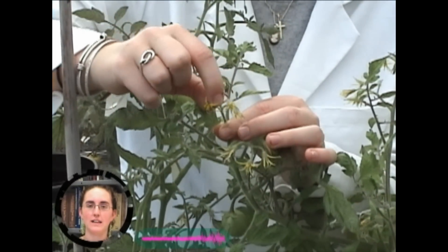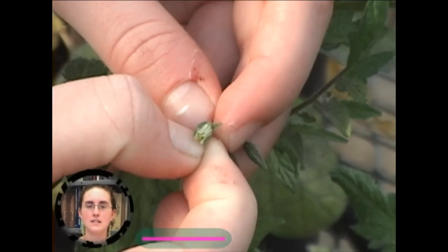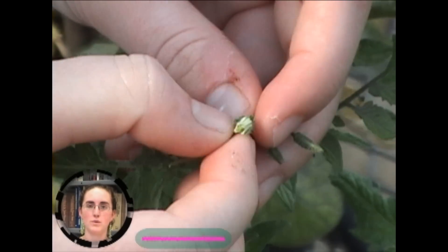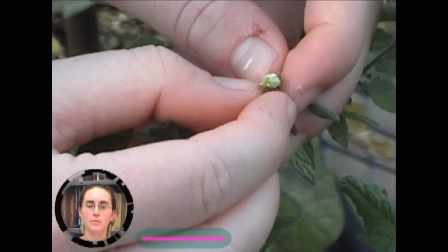First, we remove all the fully-opened flowers from the female plant to reduce the number of self-pollinated fruit. To make a cross, we start by selecting an immature flower and emasculate it by removing the anther cone. The anther cone is exposed by first removing the bracts and the petals.